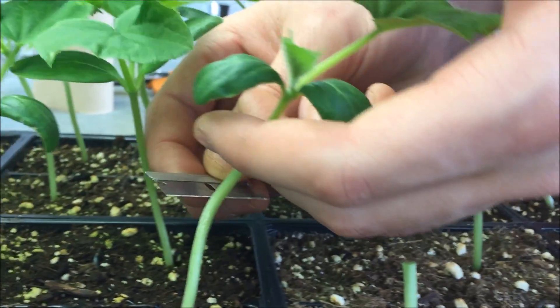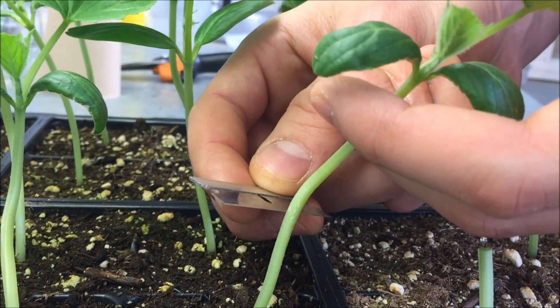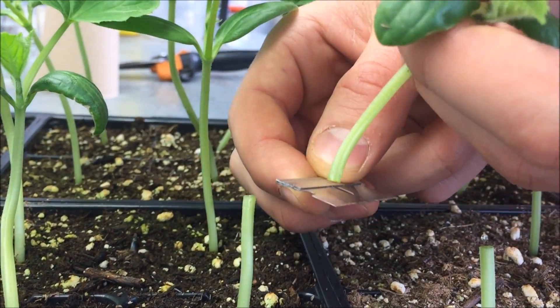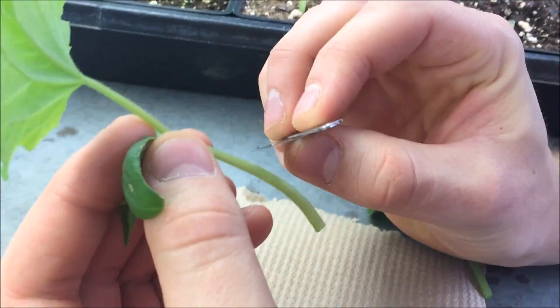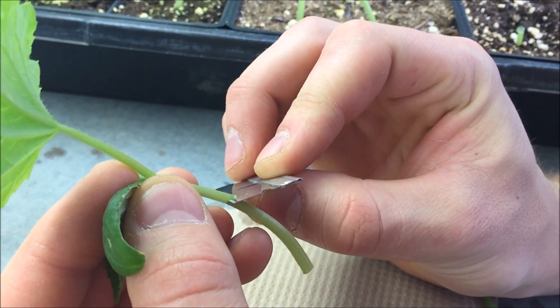Now that the rootstock is ready to be grafted, let's prepare the scion. Using a LP cucumber plant, cut off the above-ground part with the razor blade. Then another slanting cut is done on the stem but upward this time, to fit with the rootstock.